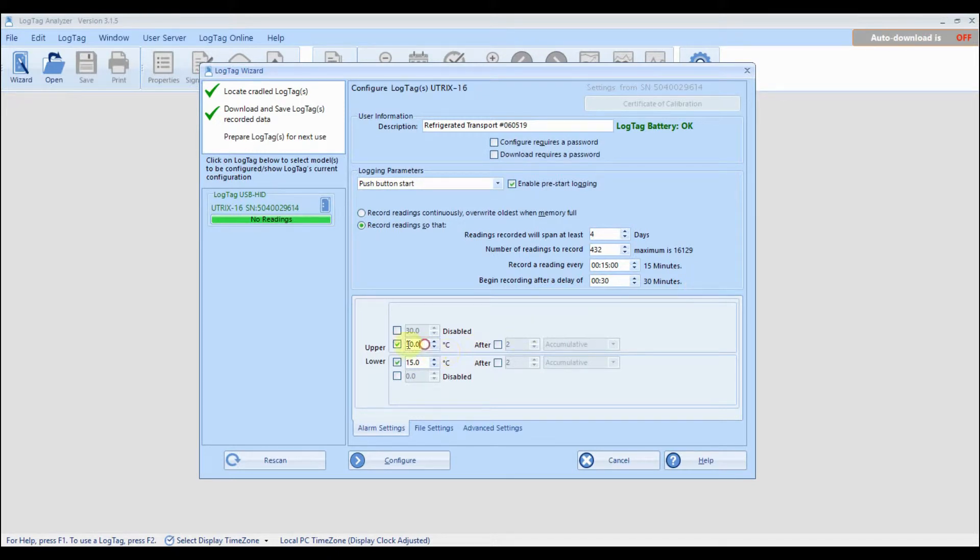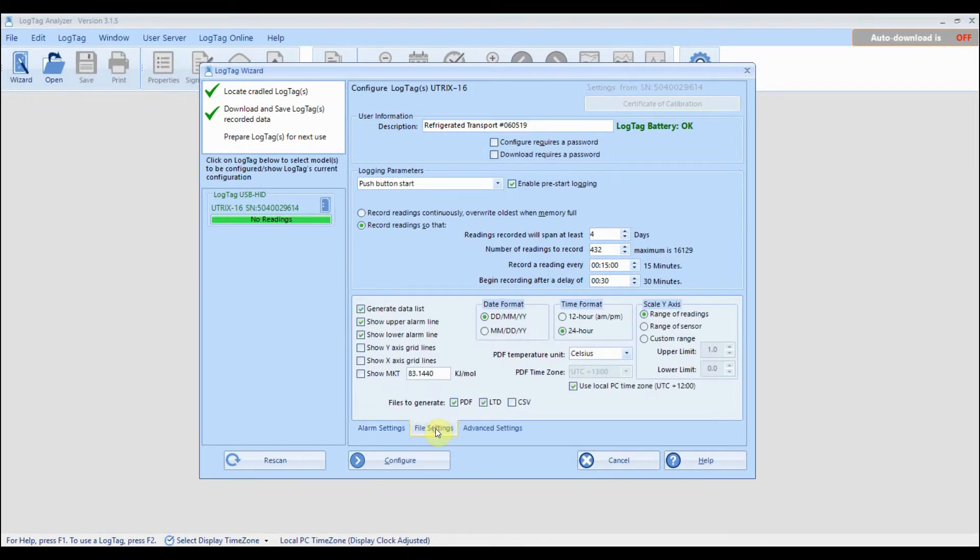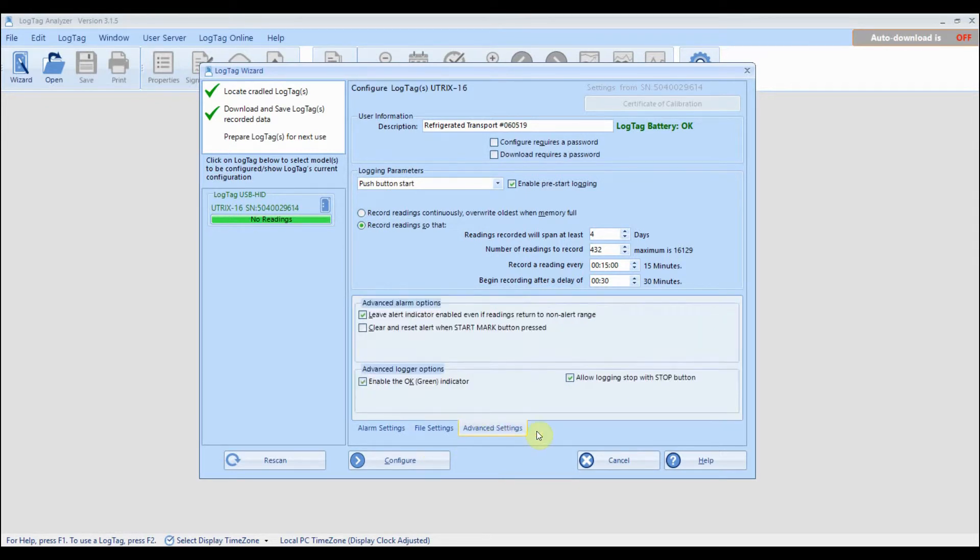Enter in the temperature values that will trigger an alarm if readings exceed their specified alarm temperatures. Finally, there are additional options available on most loggers by clicking on a tab and customizing the settings to meet your requirements.